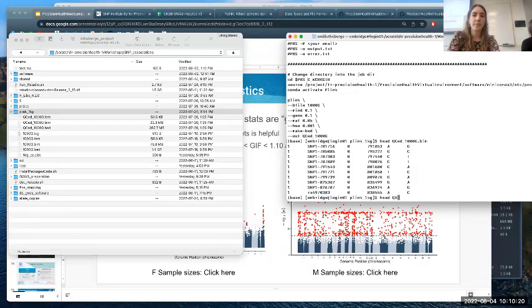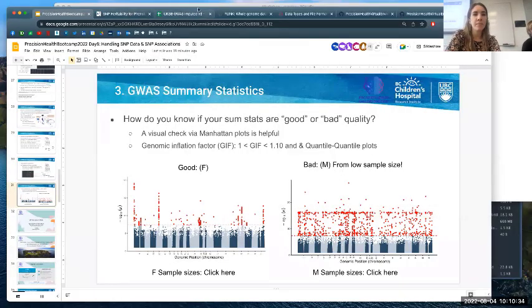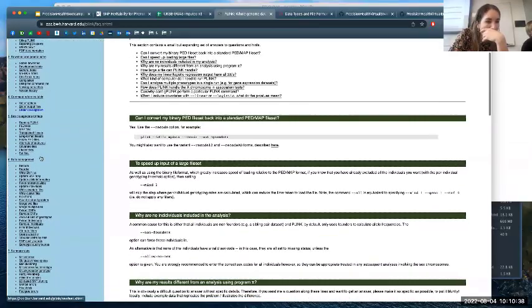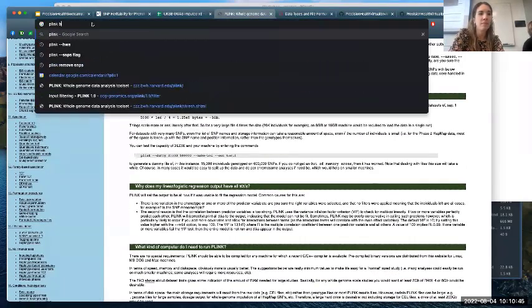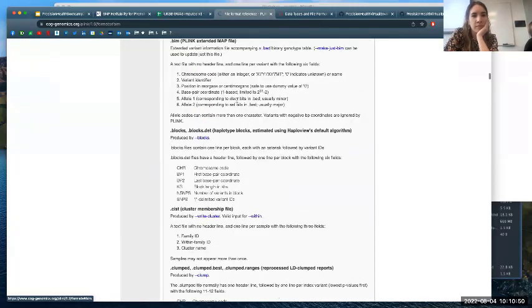But if we do not convert this SNP ID to the RSID, will PLINK still run? Yeah, that's a good question. PLINK will still run no matter what format the ID is in. Where it comes in handy is when you're referencing. For this example, we have 1,000 Genomes as our individual level data. I'm using it as a reference panel, which isn't advised. I'll get into that later. I'm using it as a reference panel for our migraine data, or migraine SNP data.